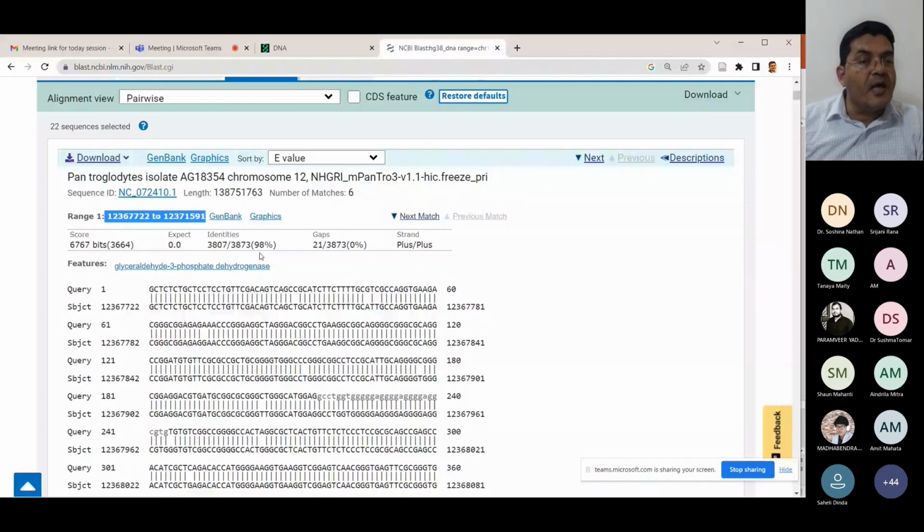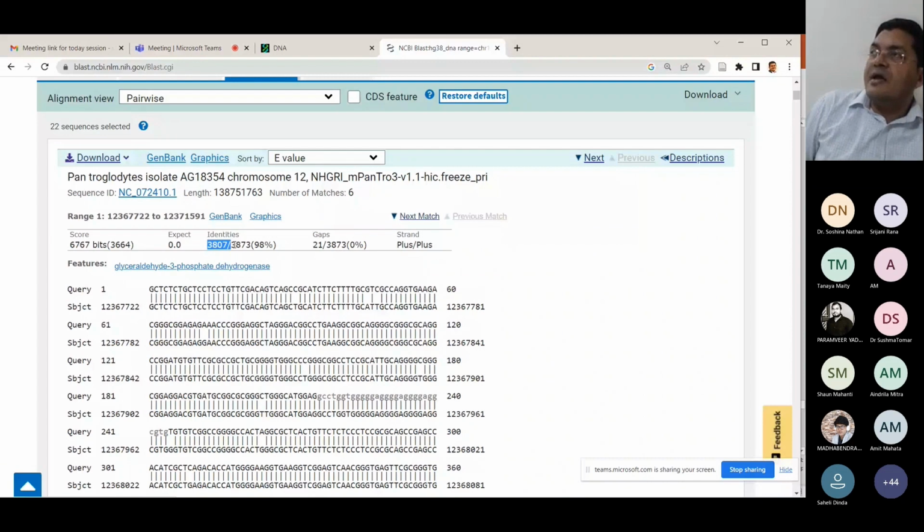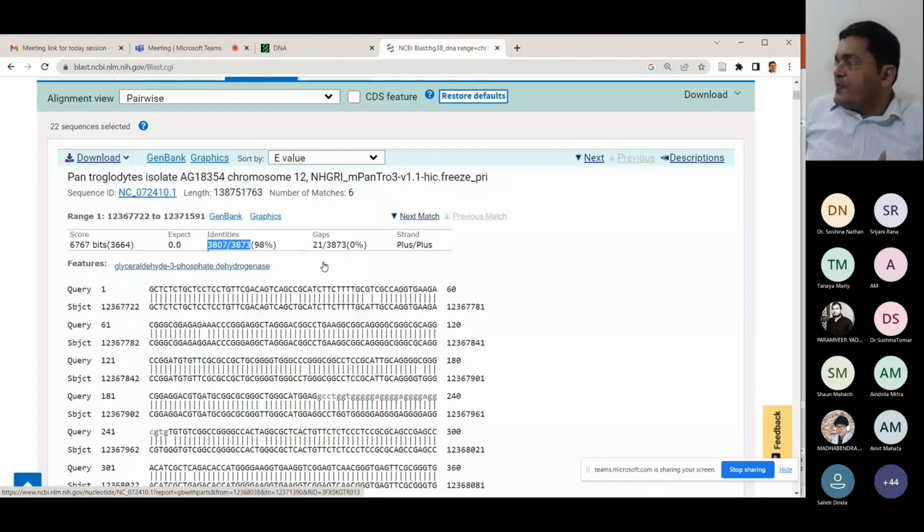Then you quantitate the extent of similarity by the similarity score. The identity or similarity is the same in the case of nucleotide sequences. So when you do a BLASTn, identity and similarity are the same, because A matches A, T matches T, G matches G, and C matches C, or not at all. When you're doing the same for protein sequences, identity and similarity are different. You may have a different amino acid of a similar class to the amino acid that was present earlier in the other genome. So identity is different from similarity in protein sequences. It is exactly the same in nucleic acid sequences. You follow, class, everyone?